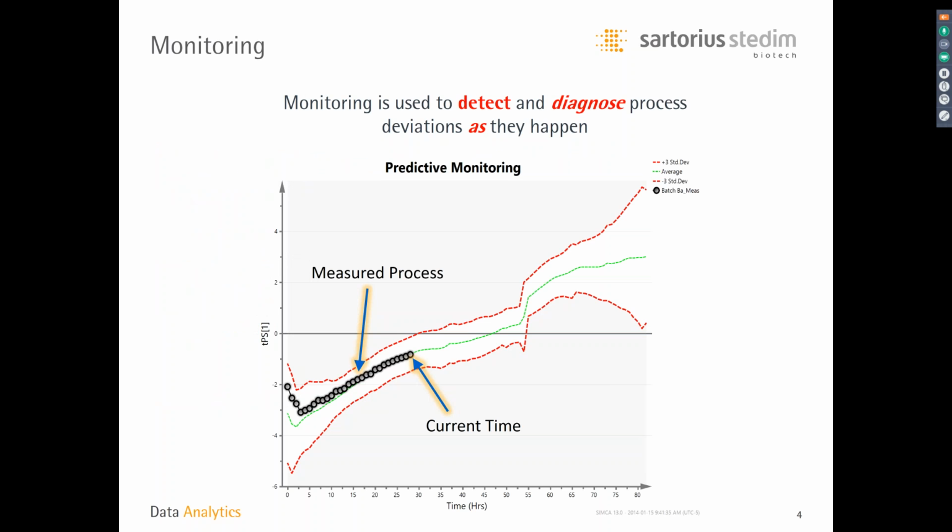If you take the typical monitoring type of application, 10 years ago this was bleeding edge technology. Now this is barely even leading edge. This is now just the way that many of our customers work. So in biologics manufacturing, this is now the accepted way to monitor processes: you characterize and build multivariate models of your process, and then track, as the process is running, whether you are following this multivariate type of trend.